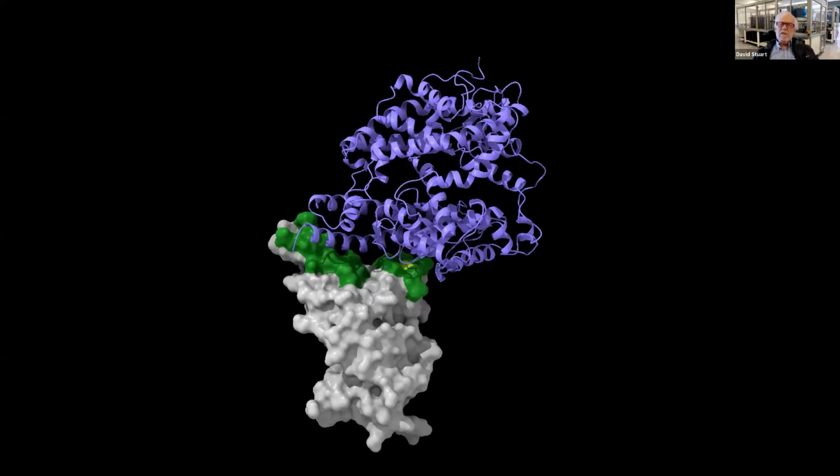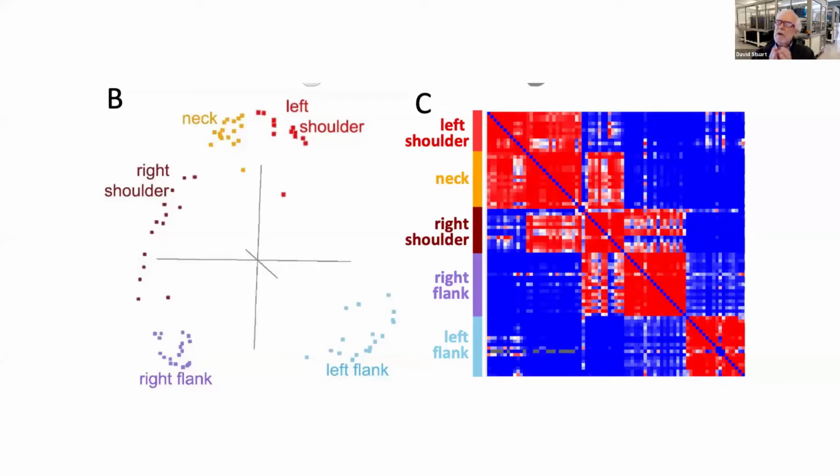How do I map them? Let's just describe how we can map them. And this was something that Helen Ginn has again implemented. It struck us that this competition data is very redundant, very information rich.